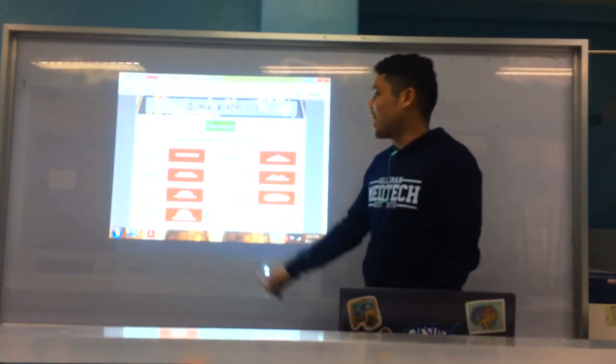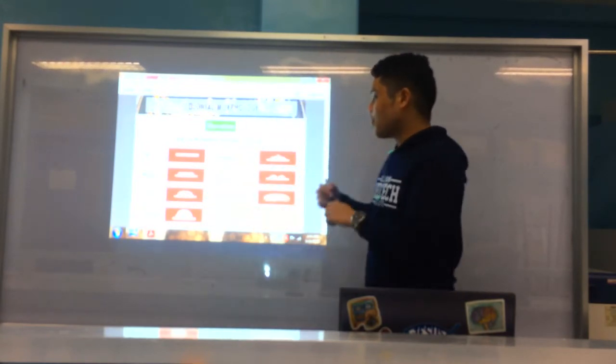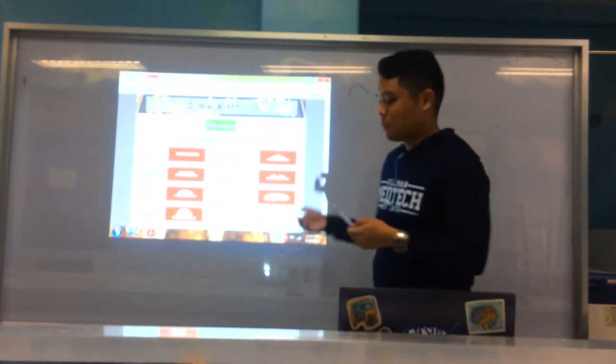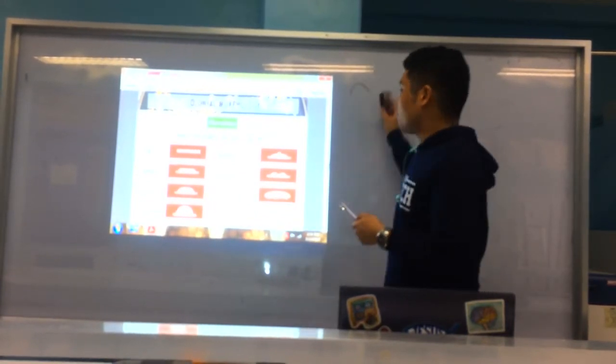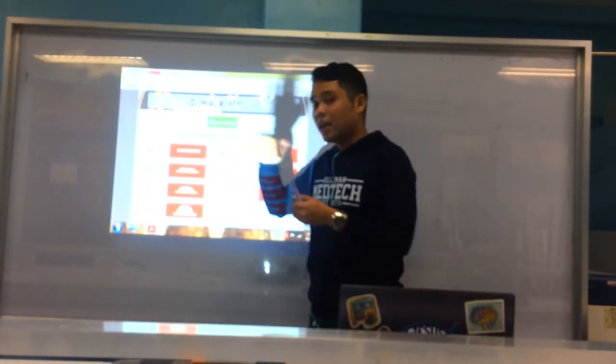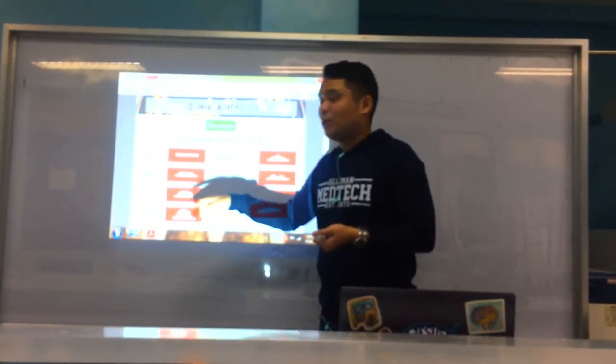Alright, next you have raised, medyo elevated, gamay. Convex, mara siyag mountain, mara siyag hill. Pulvinate, medyo steep, mas raised siya compared to convex. As you can see, mara na siyag mountain na yun, no?